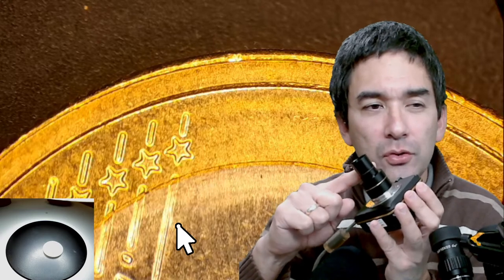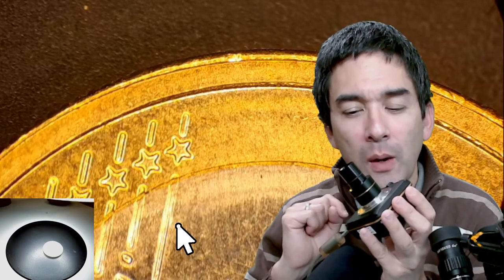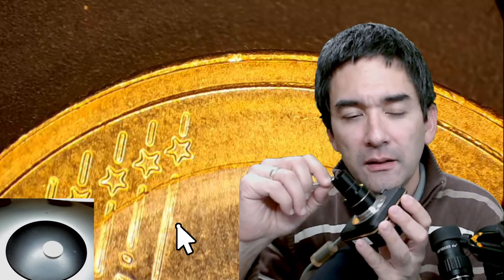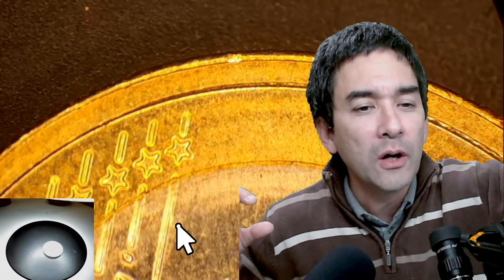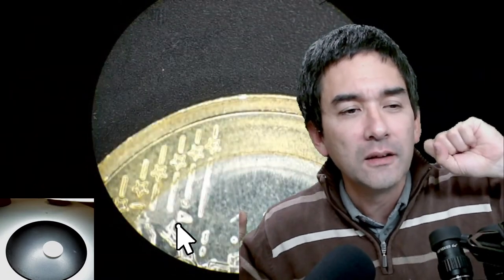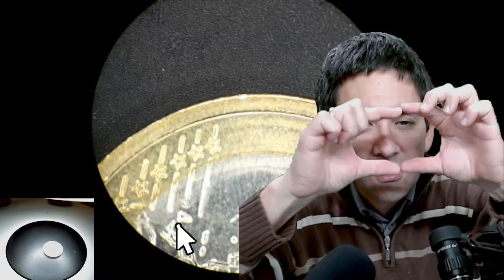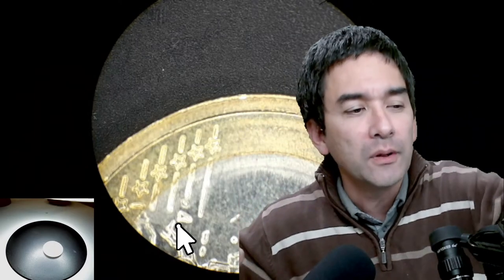The blurriness happens because the camera optics add extra magnification, blowing up the image. With the mobile phone I can see the full field of view — not just a small section in the center like with a dedicated camera. I just zoom in a little bit and get a significantly larger field of view and slightly more image clarity.